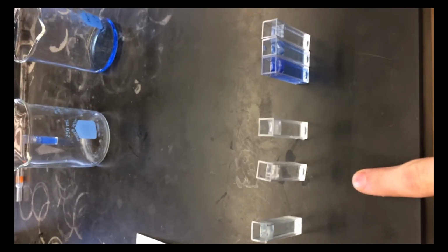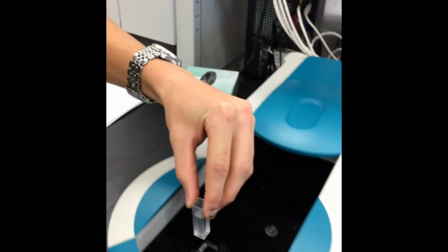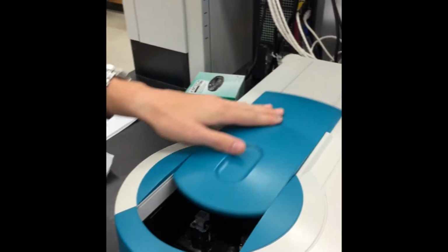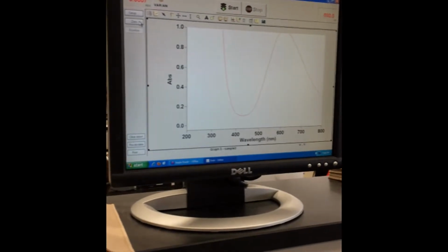So before we head to this spectrophotometer, we've got our unknown water, ammonium, and dilutions 1, 2, and 3. So first things first, unmark it and then figure out what way to... Alright, so after wiping the cuvette down and making sure we get the wiped sides towards the light bulb, we're going to zero it.